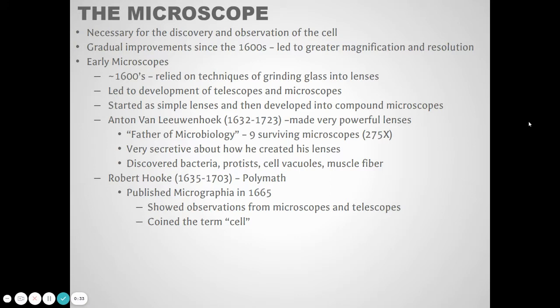Let's start with a microscope because it's one of the most important tools. Also one that you frequently will use in school, right? I'm sure you have before. But microscopes were really important because before there were microscopes, people didn't really know about very, very small things. They didn't know about tiny little organisms that live in the water. They didn't know that blood is made of tiny little cells. They didn't know that anything was made of cells. Because those things are so small, you can't see them without a microscope or some kind of tool.